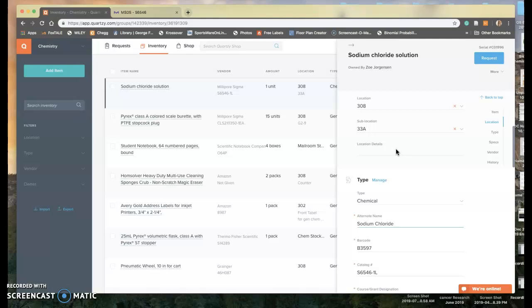One thing that is really helpful to do is you can set it aside, put a note on it, and then either Teresa will see it when she's in and write on the note, or she might walk by and answer your question right then when you're working. If you are at the end of your shift and it's still here, and you don't know what to do with it, leave it out on the counter with a note that says, I don't know where to put this, or with your question near it. Make sure you write your name on the note so people know who's asking, and then hopefully someone will be able to come by and answer that question.